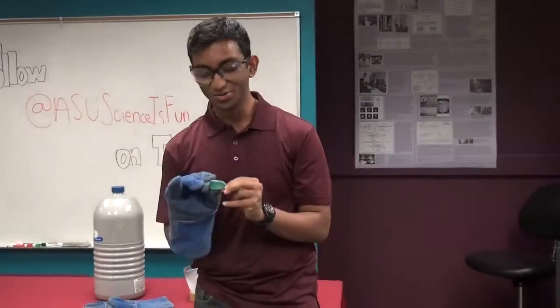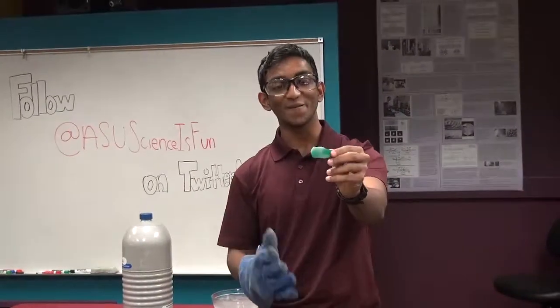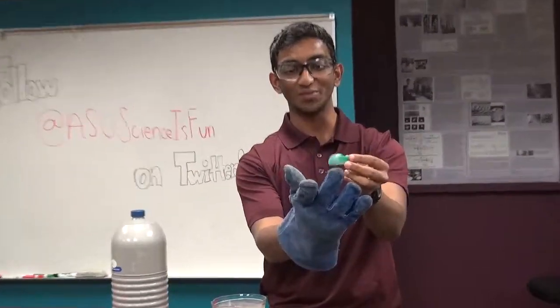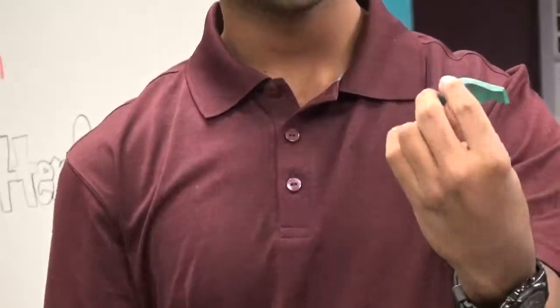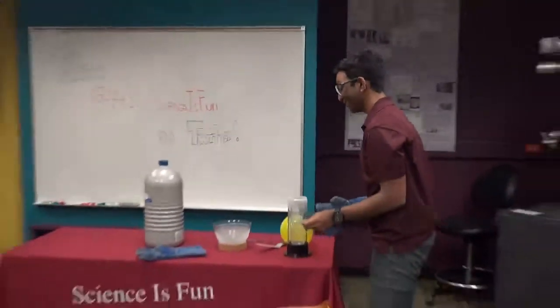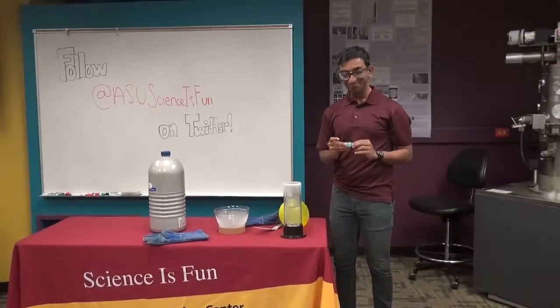Now, soon, this entire thing is going to go back to normal. You can see that there's some frost on there. There's normal parts where you can see it's rubber, and you can see the frosty part where it's still hard. Soon, everything will go back. You'll all get a chance to touch it at the end if you'd like to.